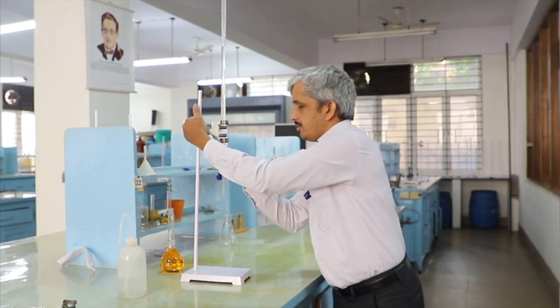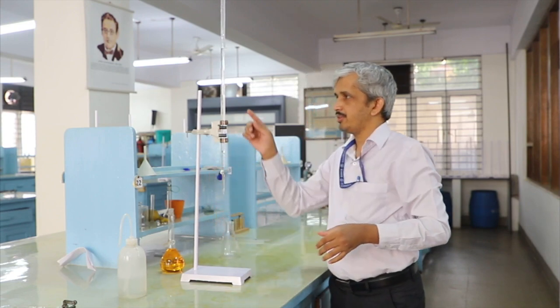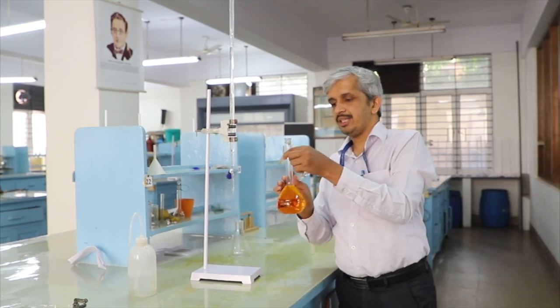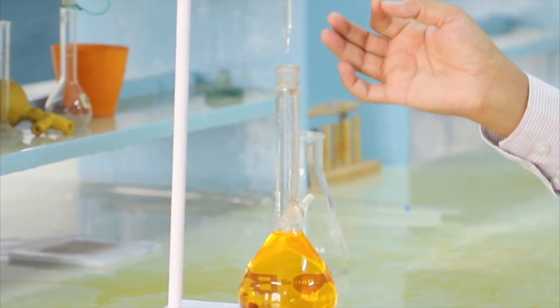And I will add distilled water slowly. So here we have now distilled water. I am going to add distilled water inside this very slowly and carefully. So in the buret we have proper control. I can add slowly, drop by drop.